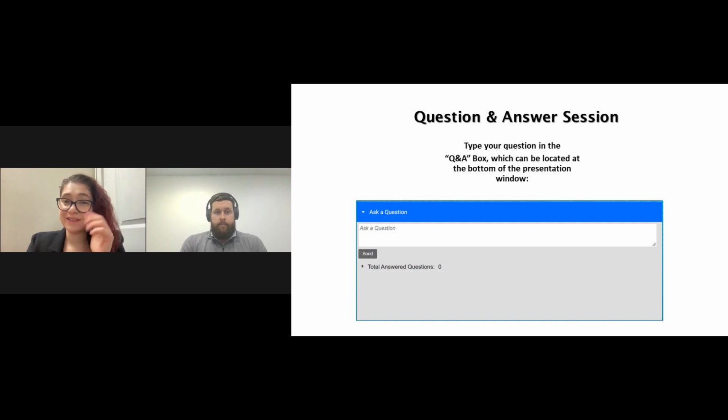Fantastic, thank you. Next question here. Can you only install an SPL injector, or can other injectors be installed as well? That's a great question. Currently, the only injector available is the SPL, the splitless inlet. The OCI, on-column injection, or the PTV, Shimadzu's programmable temperature inlet, will be accommodated and accessible with the GC-2050 coming in April, late springtime this year.